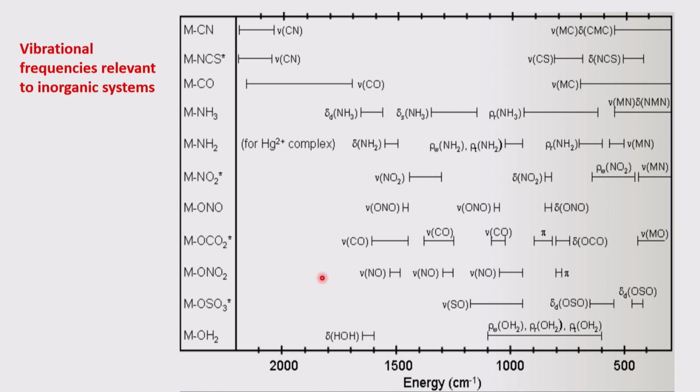When the carbonyl couples with the NH in the amides, there are different kinds of vibrations coming: amide 1, amide 2, amide 3. So they all come starting from 1600 down, not higher.